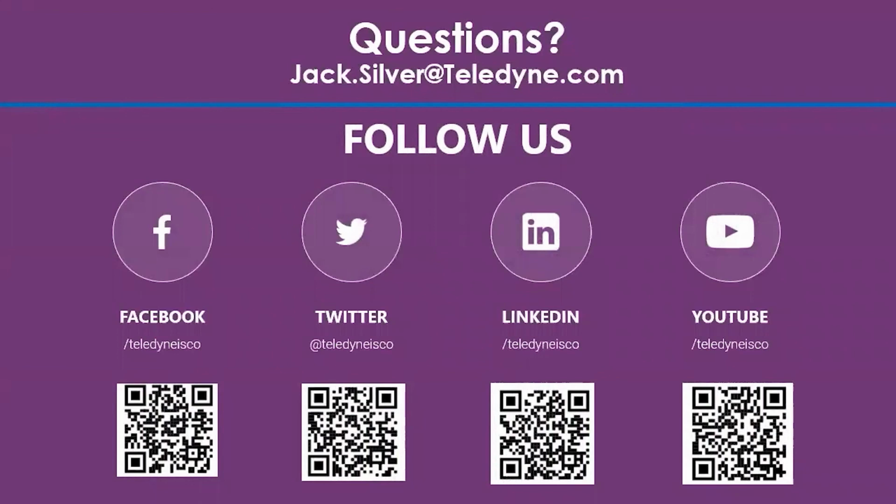Of course, I presume you're using, say, a solid load cartridge for your gradient or something. But yes, you can do that. We haven't done the calculations for focus gradients on a half a gram column. The other thing to be aware of is that the dwell volume of your system is very, very large, and that's going to affect the scouting gradient greatly.